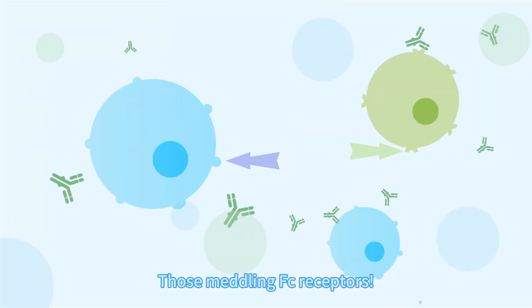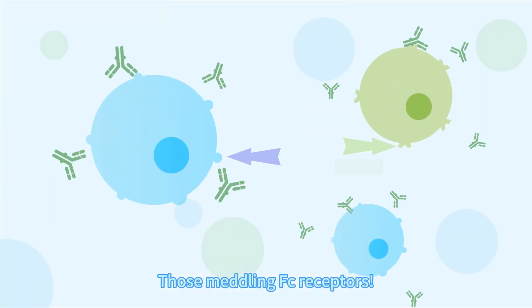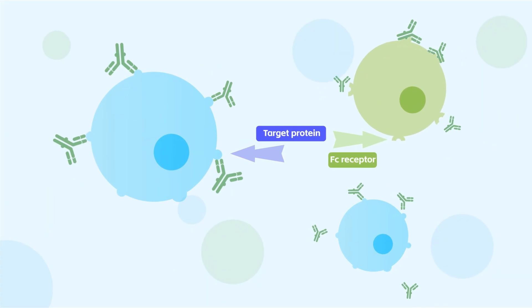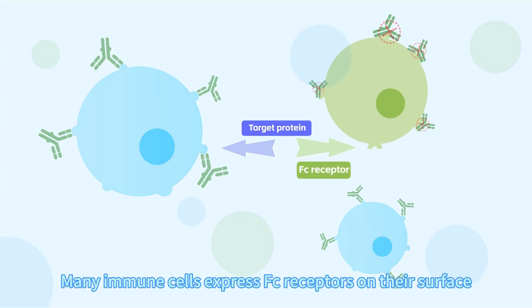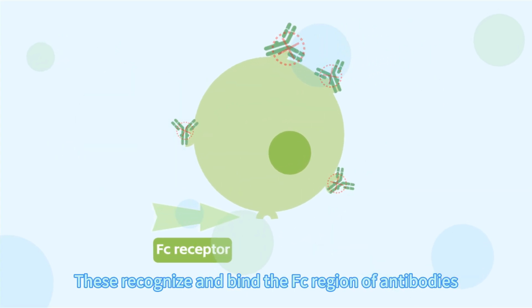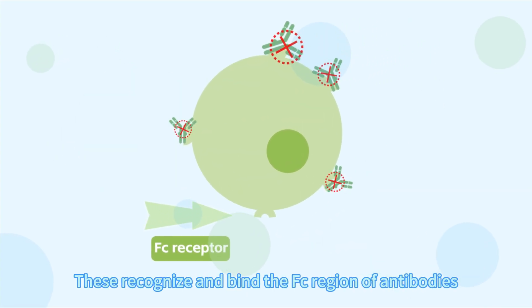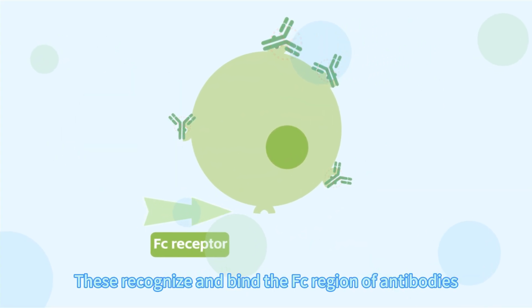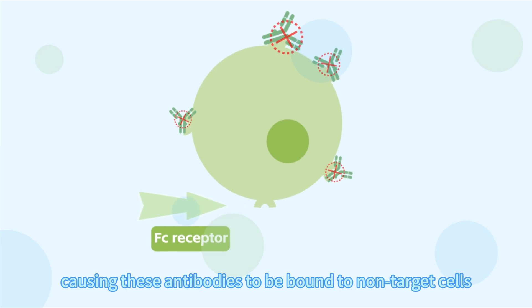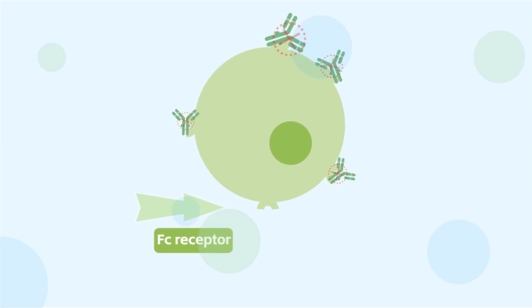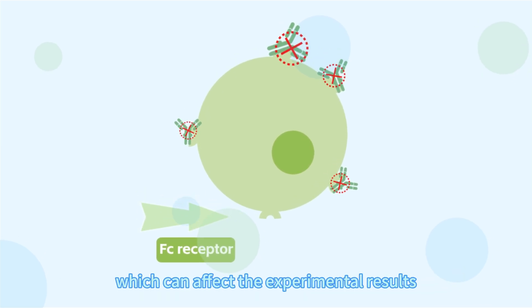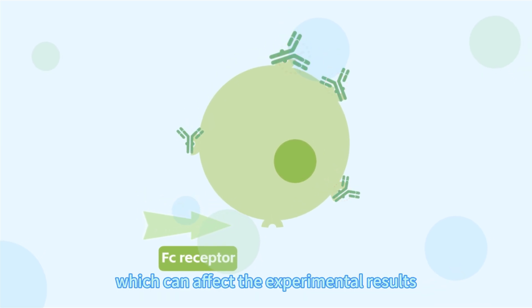Those meddling FC receptors! Many immune cells express FC receptors on their surface. These recognize and bind the FC region of the antibodies, causing these antibodies to be bound to non-target cells, which can affect the experimental results.